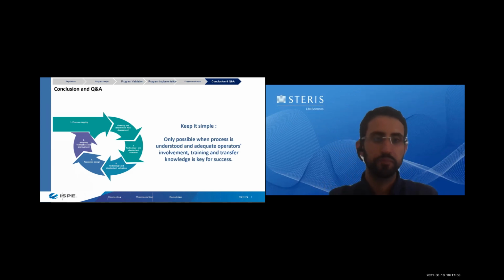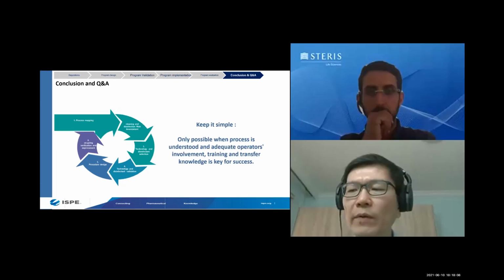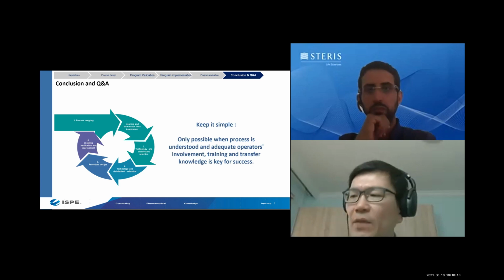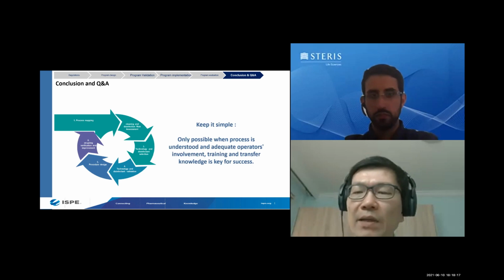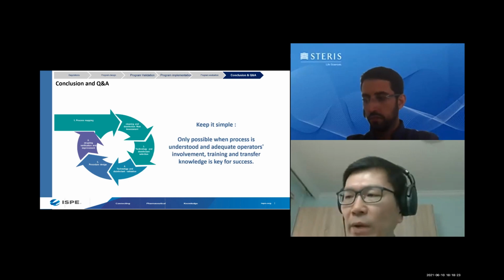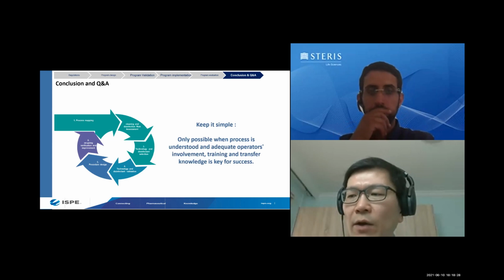Yeah, for in-situ comparison studies, there's no fixed method. One of the methods you can base it on is USP 1116, which talks about the contamination recovery rate. That means the frequency of non-zero recovery on your plates when you do all the samplings. So that is one of the methods you can compare.